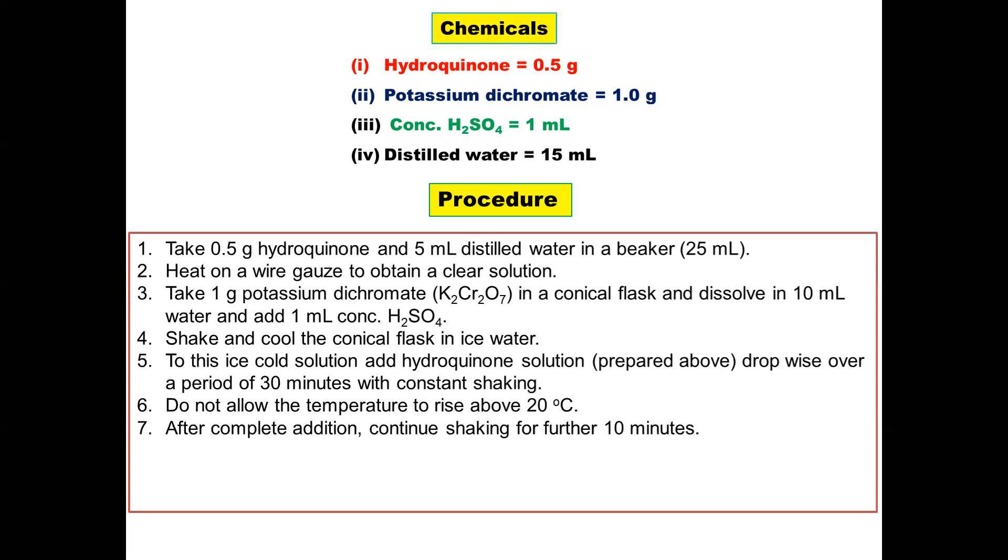After complete addition, continue shaking for further 10 minutes. Yellow crystals of quinones separate out. Filter on a Buchner funnel and dry it well.